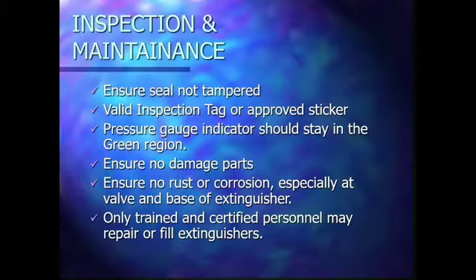Inspection and maintenance is very, very significant and important for us to maintain and inspect regularly our fire extinguishers, especially those that are exposed to the environment. We have to firstly ensure seals are not tampered.